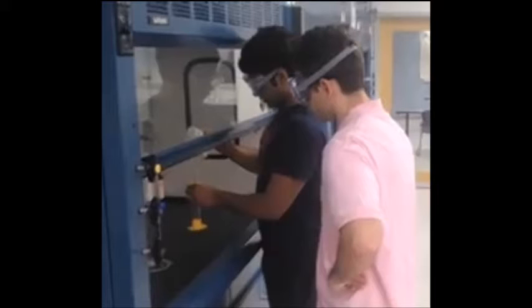So let's begin. In life and in your laboratory, safety is the most important thing. Mainly, where the location of safety equipment is and how to properly use that safety equipment. Always be sure to note the locations of your overhead shower, the eye wash, fire blanket, first aid kit, and fire extinguishers. Obviously, in the lab, you'll likely be working with strong solvents and acids and bases. So use these chemicals in the hood only. Make sure your hood is also turned on.